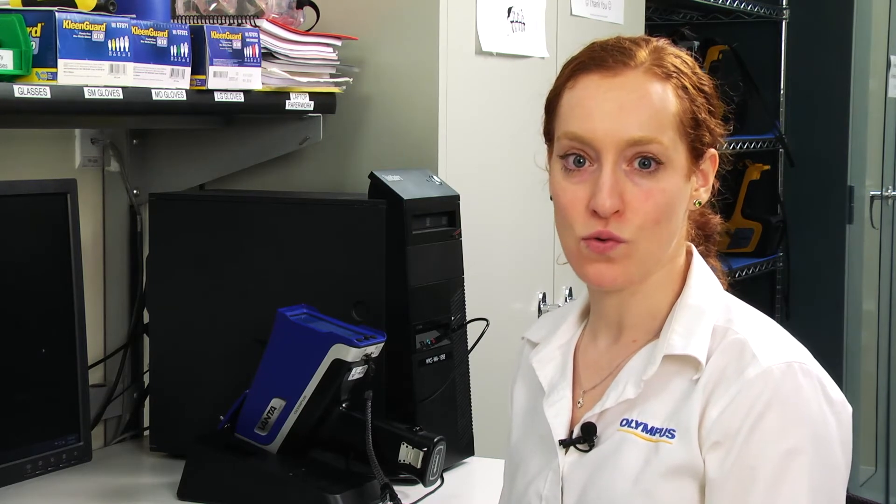Hi, I'm Jennifer Kaven. Today I'm going to show you how to export results from your Vanta analyzer to a USB storage device or the internal SD card on the Vanta.